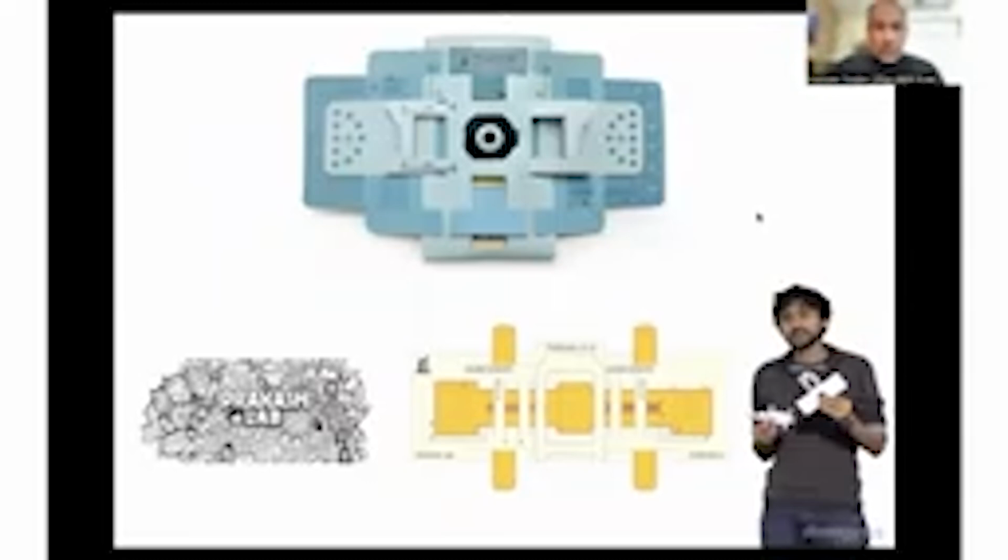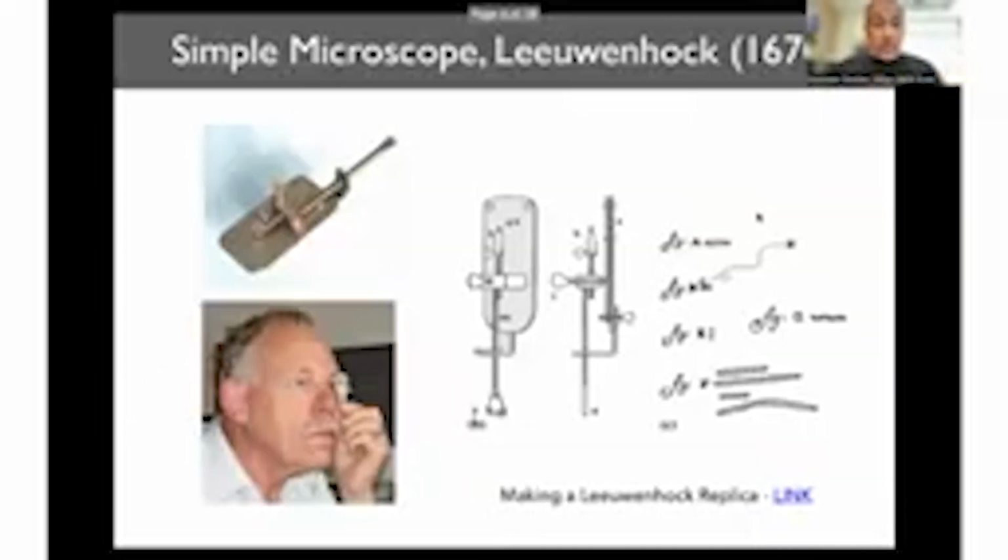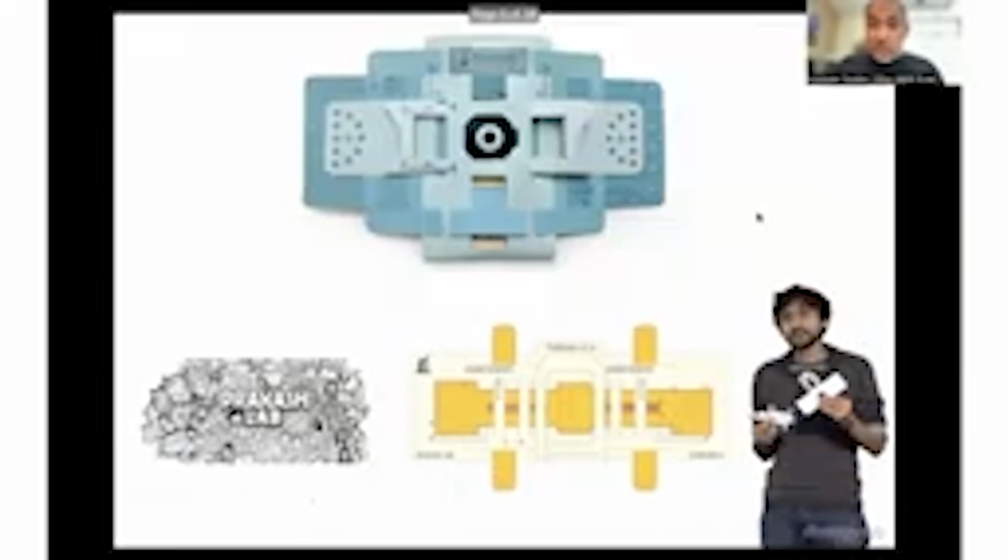And I don't know how many of you know about Manu Prakash and this Foldscope that they developed a few years ago, right? And it's a remarkable thing. Manu's lab is in Stanford, and they develop, among other things, tools. This is a paper microscope, right, which takes its inspiration from what Leeuwenhoek built so many years ago.